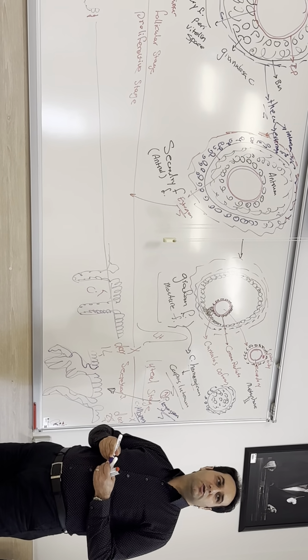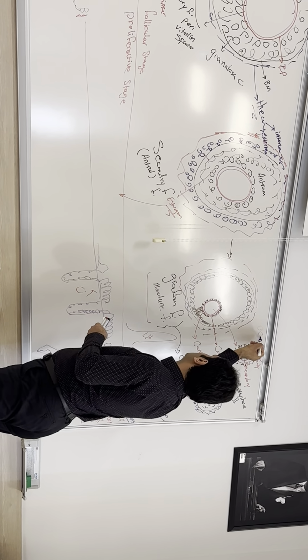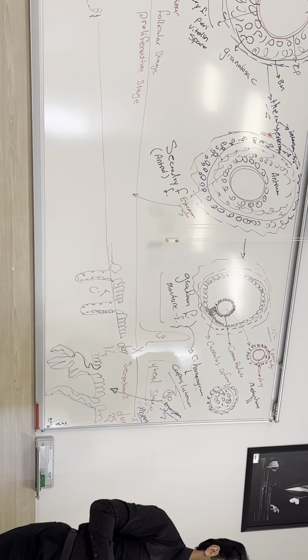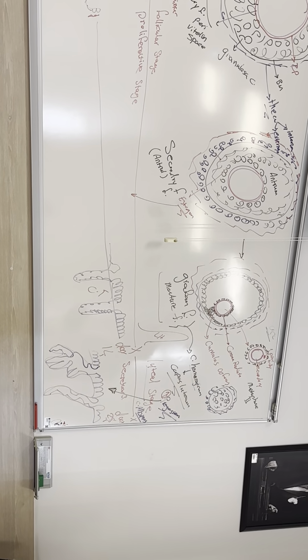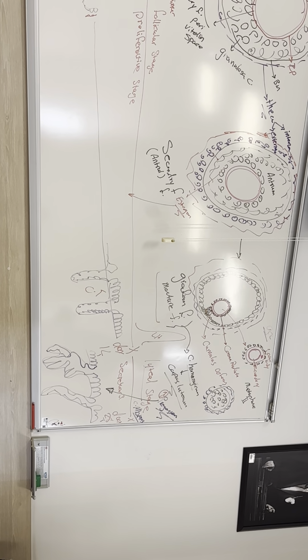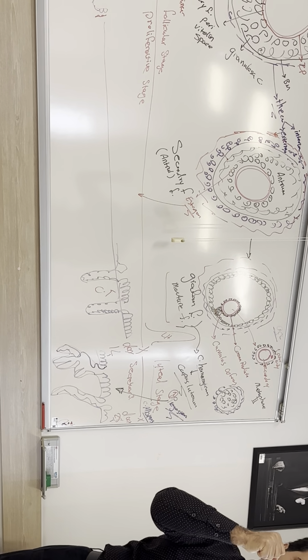This is our oocyte cumulus complex, which ovulated from the ovary and exits into the luminal side of the peritoneum and is caught by the fimbria of tuba uterina.